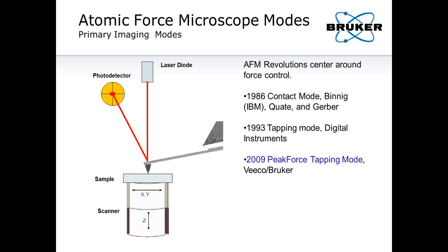So how do you know the force is changing? And that's where the cantilever in this probe, the micro cantilever, is used for. So under force, this cantilever will deflect, either bending down under attractive force or bending up if it's a repulsive force. And that bending can be very, very tiny.